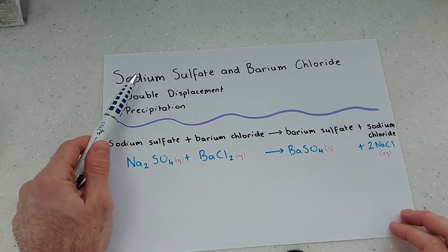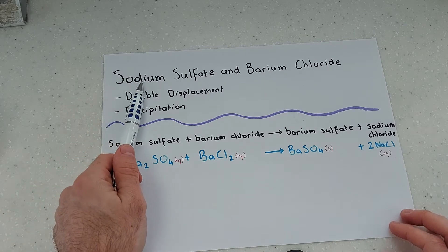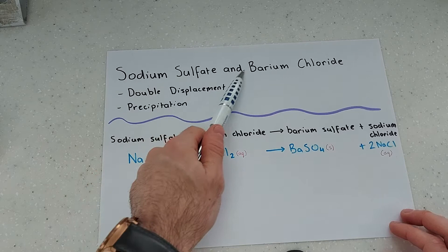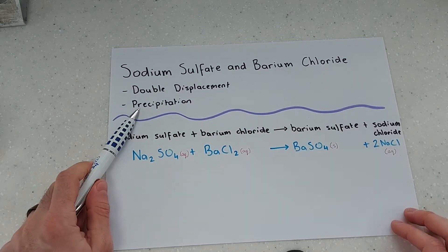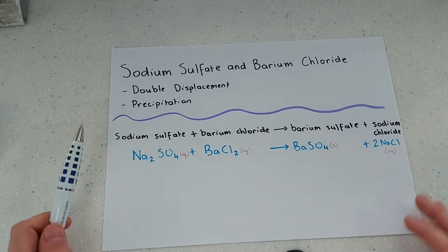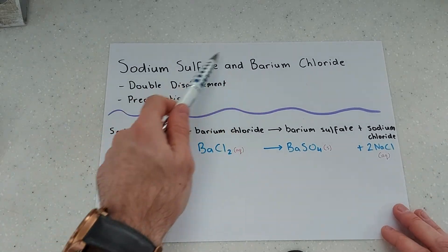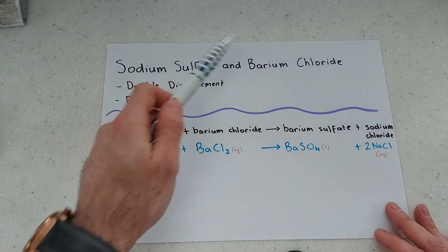I'm going to mix solutions of sodium sulfate and barium chloride and I'm hoping to produce a precipitate, or in other words I'm hoping to produce a solid from mixing these two liquids, these two solutions.